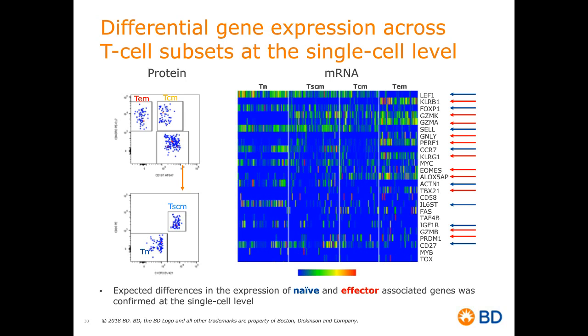And the way we read this graph, instead of having the typical one tab or one bar with a color, red for high or blue for low, that you will have in the bulk analysis, we are lining up here each cell of the cells that were sorted.